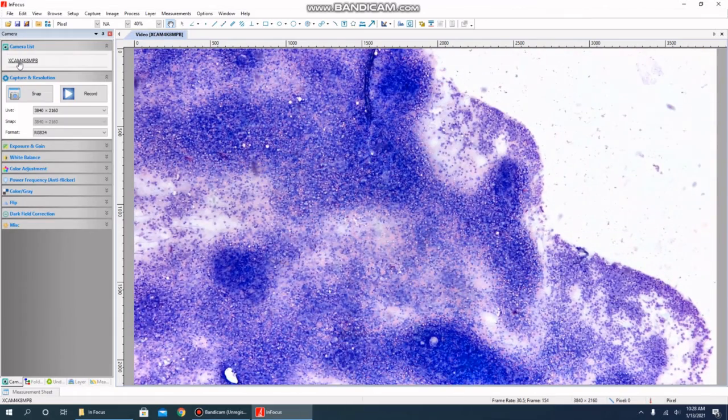That's it. We now have a live image and the InFocus software is fully installed.